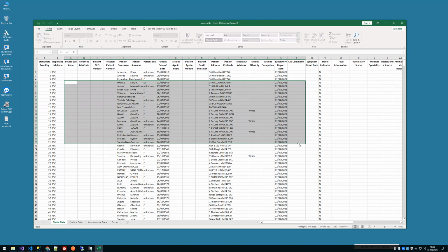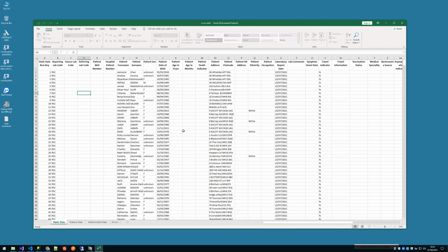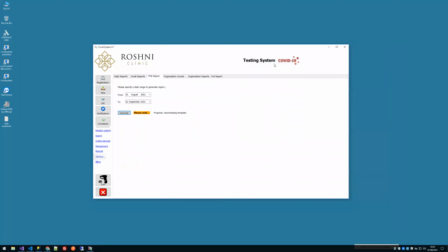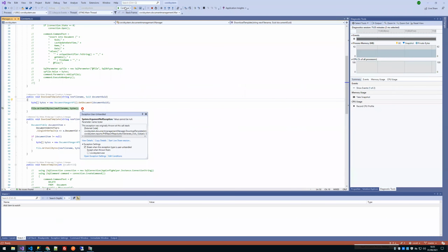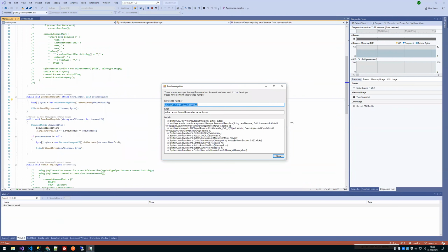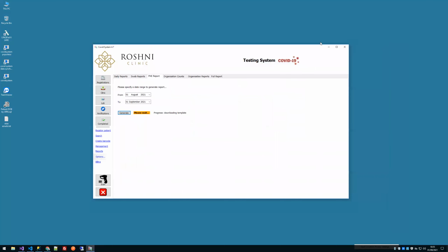So that is outstanding, that bit of work where this is an automatic email to them every day through the system. It doesn't even need them to click any buttons really. It'll just get done automatically as an overnight job. Right. So I think it's just through the secure email, basically. Yes, it's just secure email at the moment. Okay.